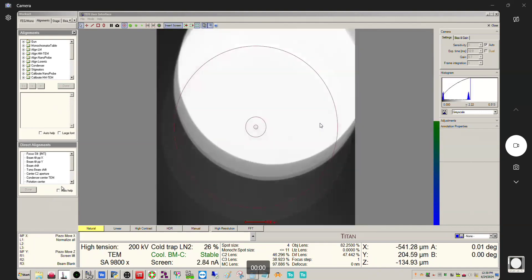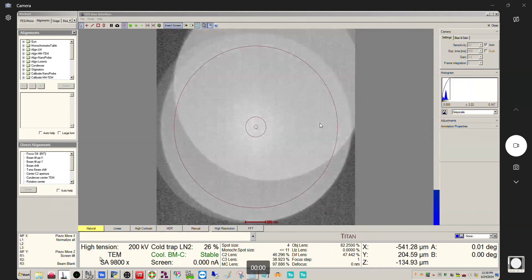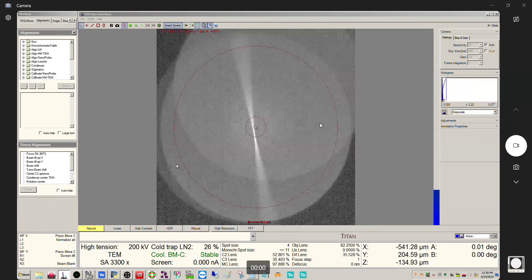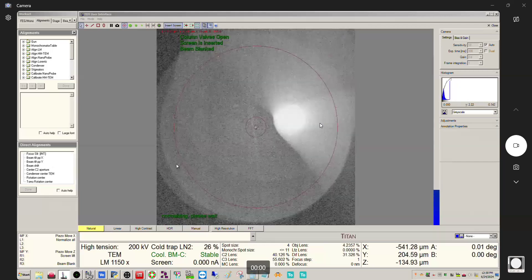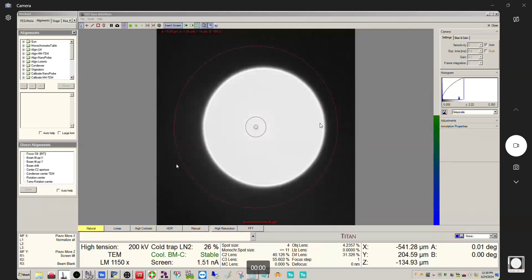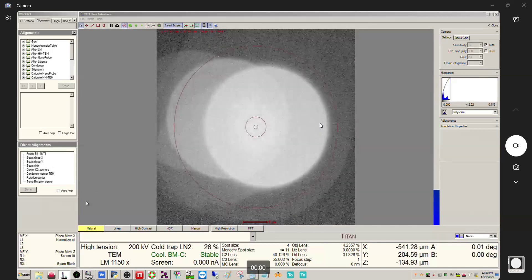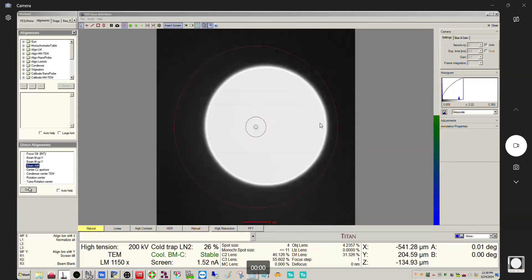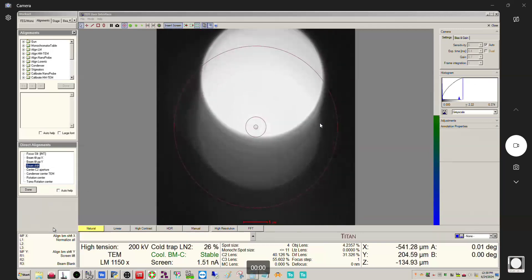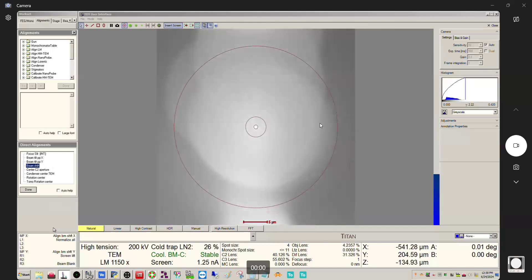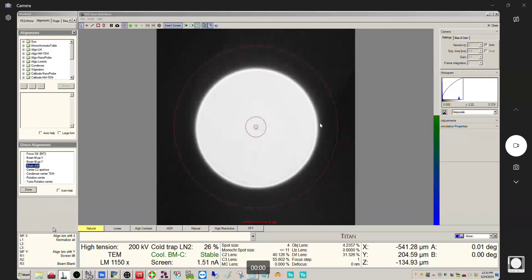The beam shift setting is unique to each mode — SA mode has a different beam shift setting than LM mode. If I accidentally shift the beam way off center in LM mode, clicking 'Beam Shift' brings it right back. Be careful: once you have beam shift selected, you can store it however you want — if you accidentally store it off center, it will go back to that wrong position. If you get really lost, go back and reload the alignment file, because that will reset the beam shift back to its default.